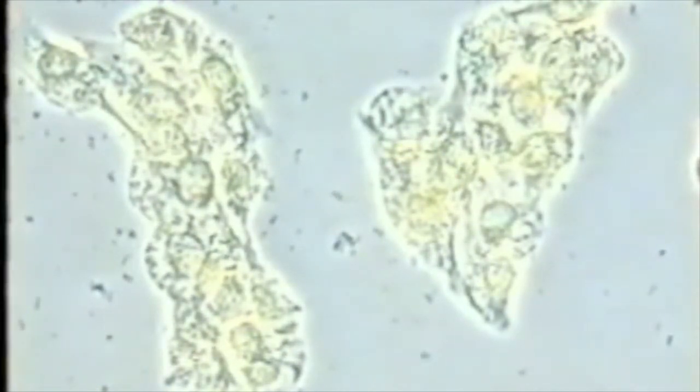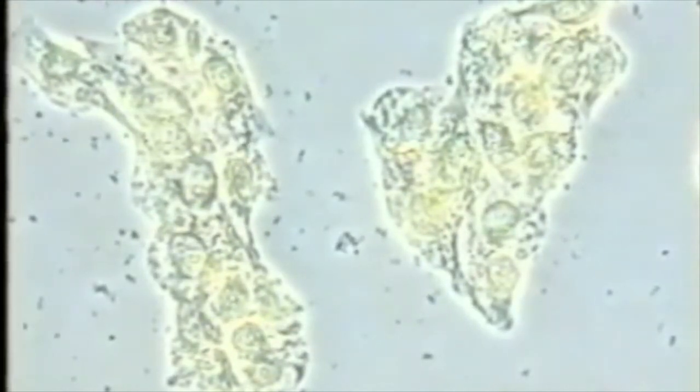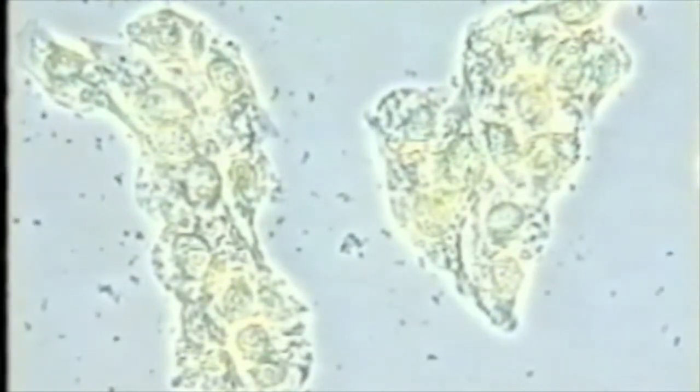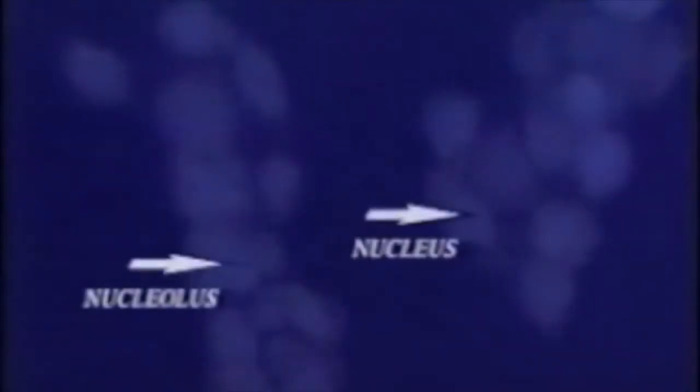Cytoplasmic membrane blisters break open. Granulations appear in the cytoplasm. A pale gold halo progressively forms around the nuclear membrane, a sign of PB100 localization. Under 270 to 380 nanometer ultraviolet radiation, nuclei exhibit a blue fluorescence, especially bright in the nucleoli, corresponding to PB100 fluorescence. Cytoplasm, staining less, contains less PB100.